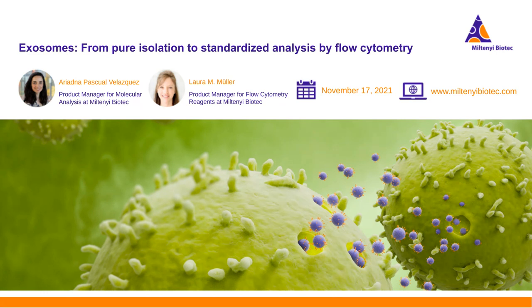Yes, so indeed, the graphics might be a little bit misleading here. Our microbeads are in the size range of 80 to 120 nanometers, so it's pretty much the same size as the exosomes. The advantage of the small size is that the beads stay in suspension, and therefore you have a very efficient binding of the vesicles to these beads because they are in close proximity during the binding reaction.